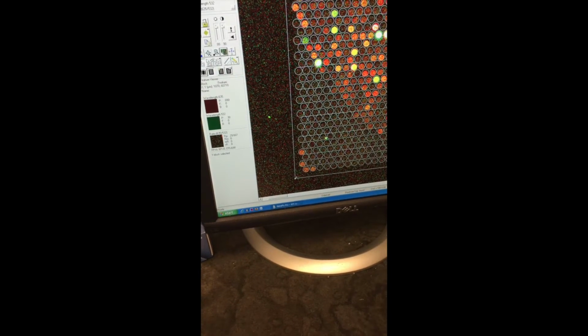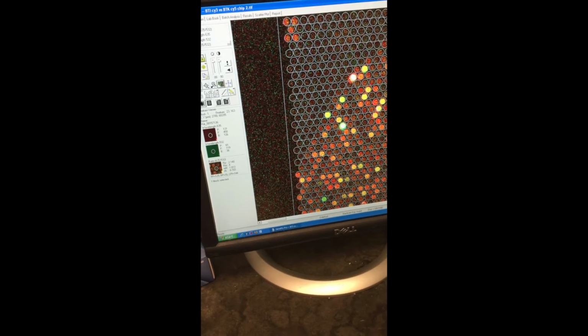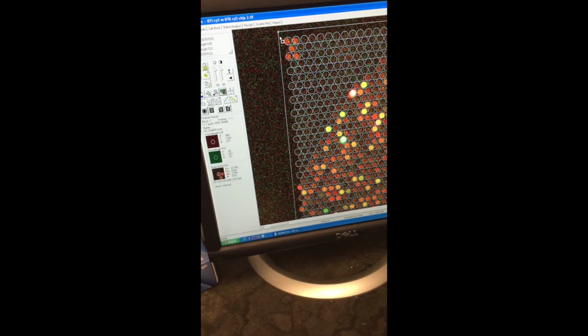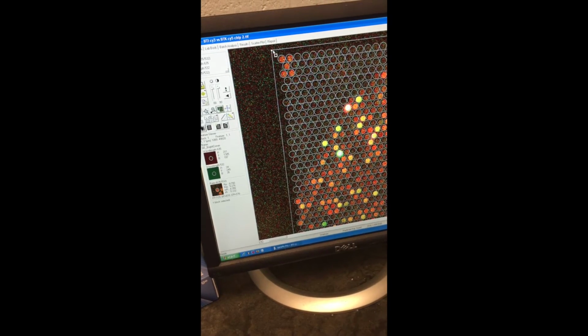Down just a little bit. Now I like to go check the corner again, right? Because I might have moved it a little bit odd. So you can just keep moving it around a little bit until it's what you think is perfect.